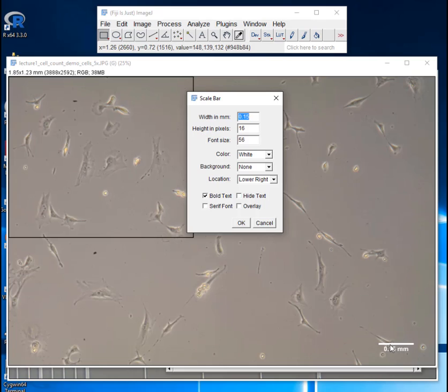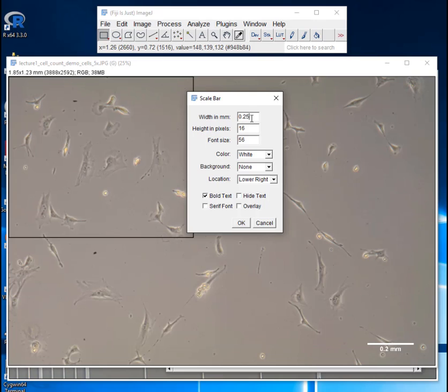So you see it draws a scale bar. So we can set the scale bar to whatever size seems convenient. Like one millimeter, that's too big. 0.25 millimeters, that might be good. And so you can set it to whatever you want.